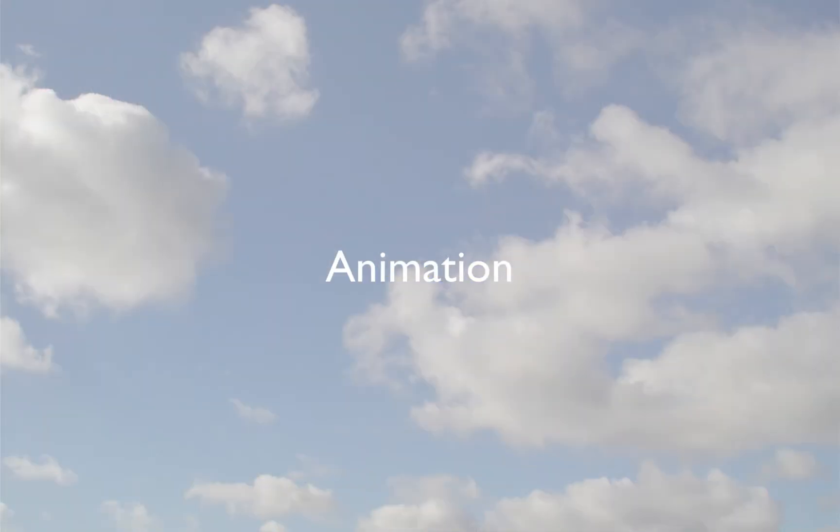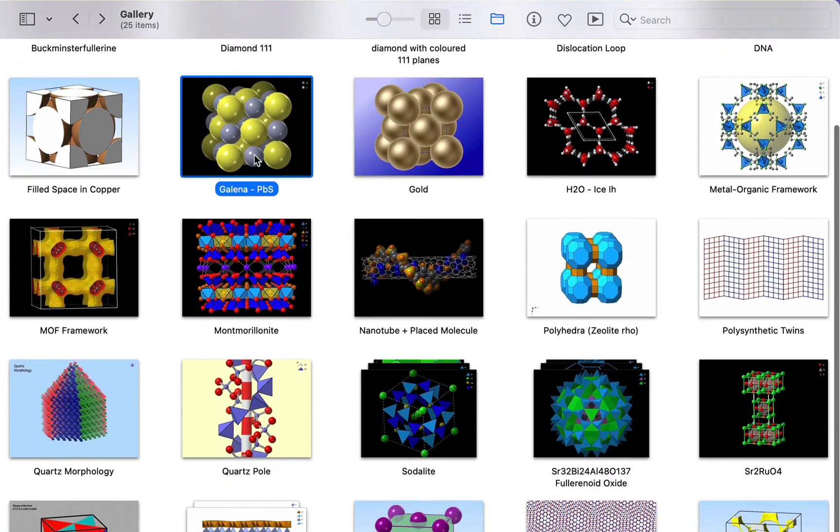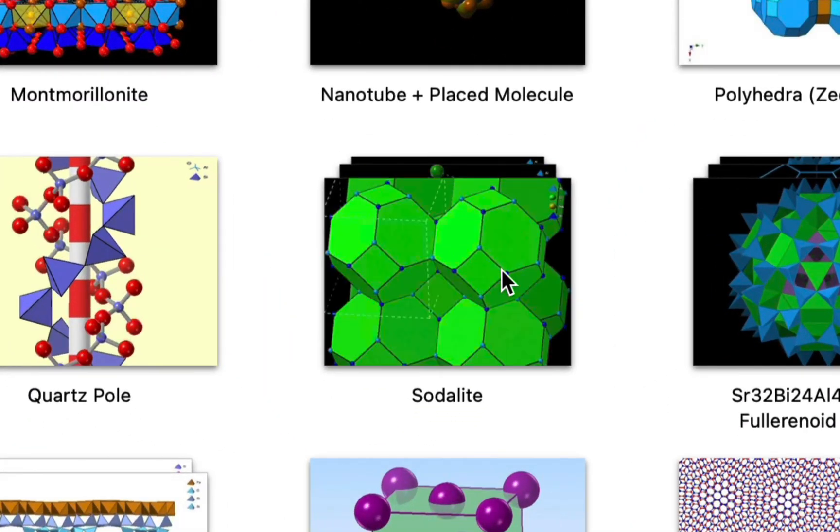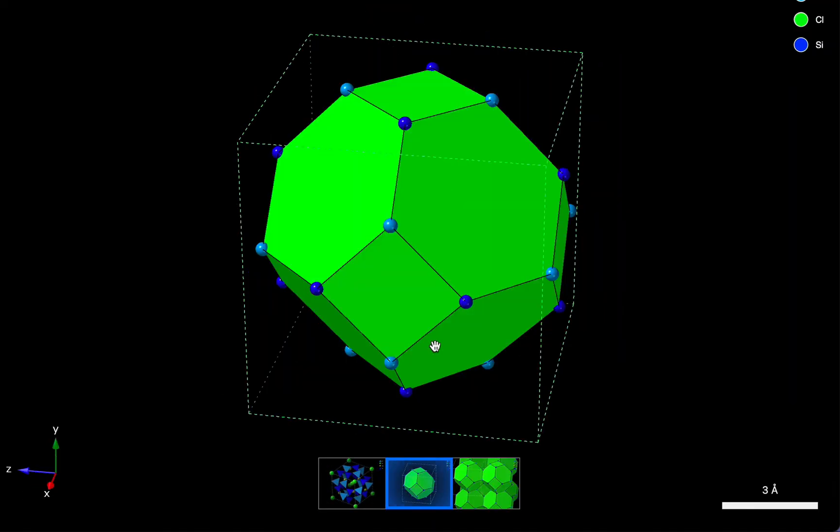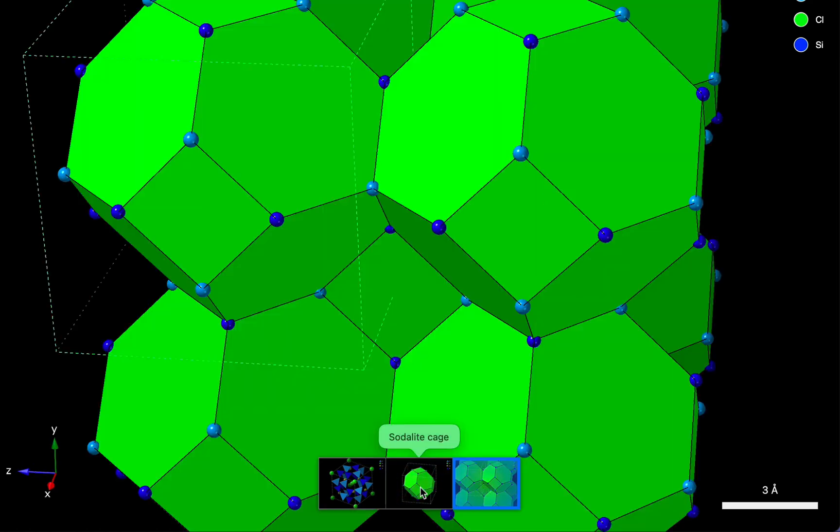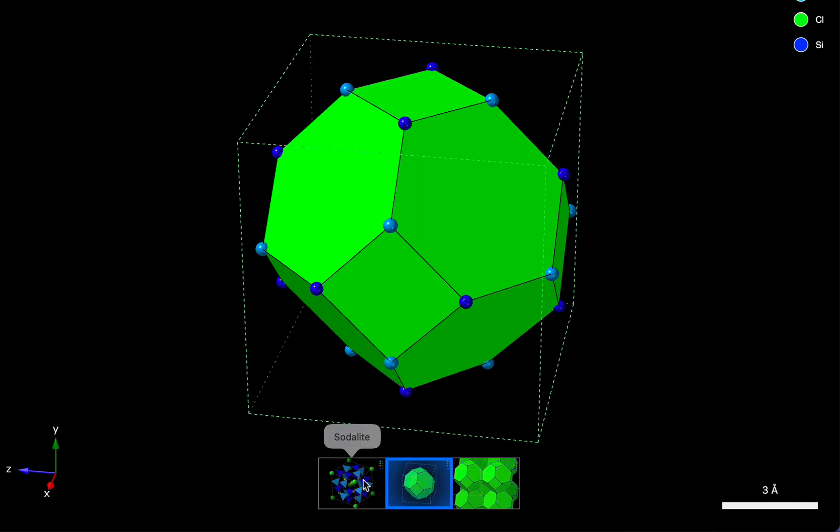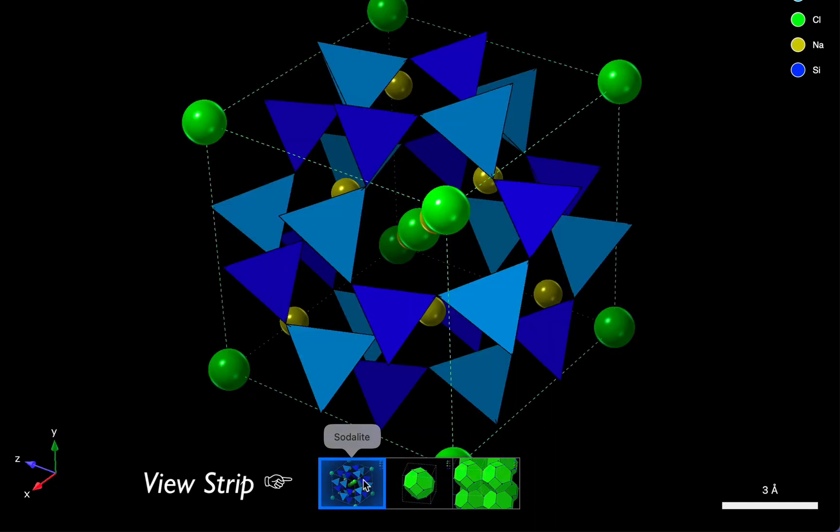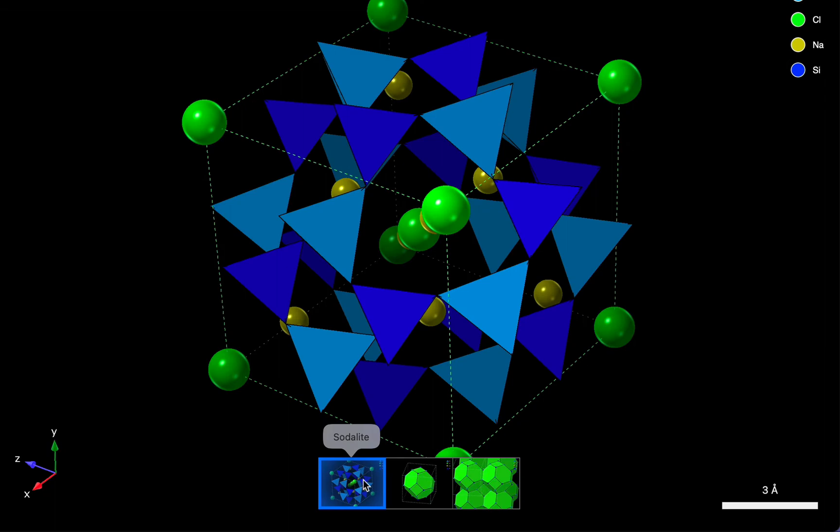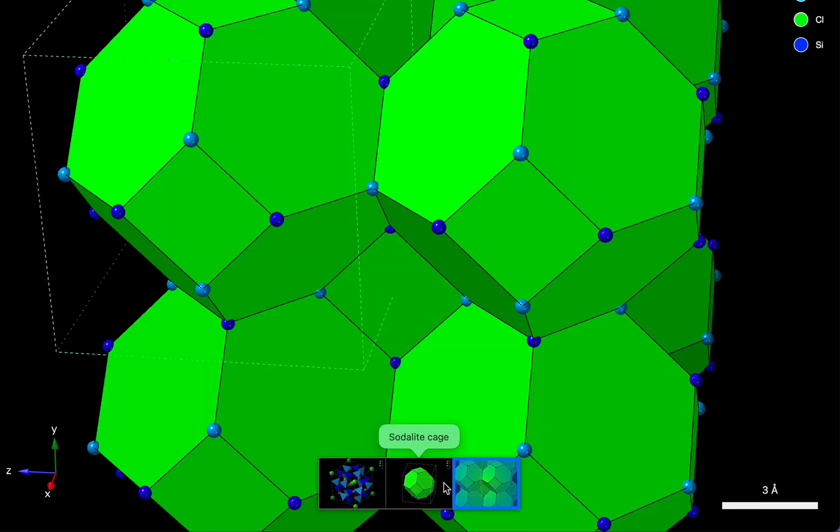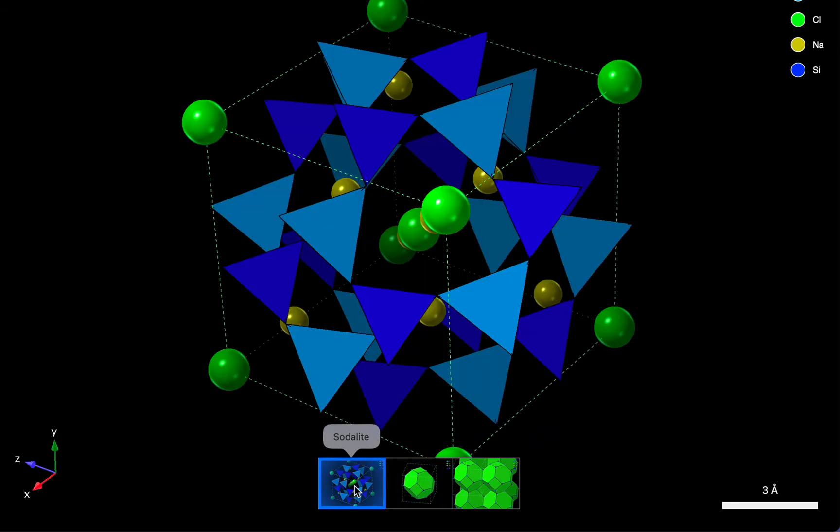Now we're going to take a look at animation. Many structures in the Crystal Viewer library contain more than one structure. For example, this SodaLite file. These contents we can preview by sliding the mouse over the structure. If we open this in the viewer, we'll see things in more detail. We can see that this file contains three structures which are represented by the three thumbnails towards the bottom of the screen. And we call this the View Strip. Now, by default, this sequence of structures animates so that you can see all the views. But you can override the animation simply by clicking on any of the thumbnails to load the corresponding structure. And you can restart the animation by double-clicking.